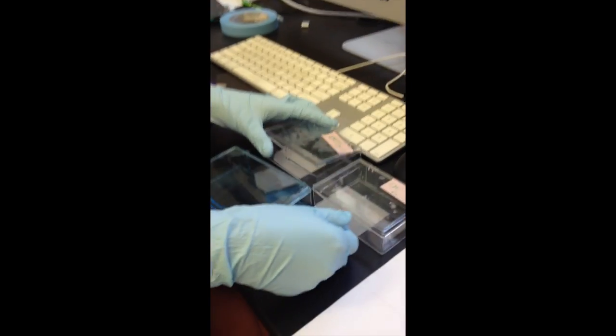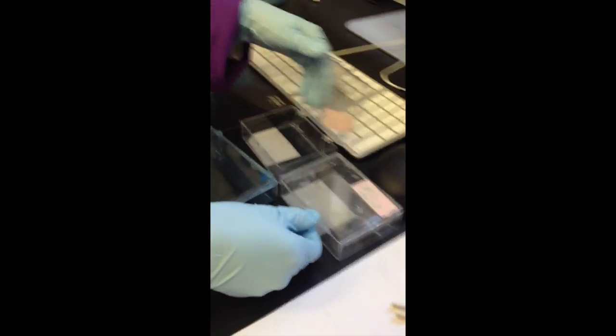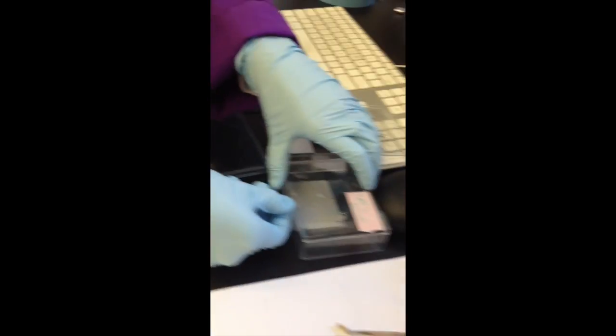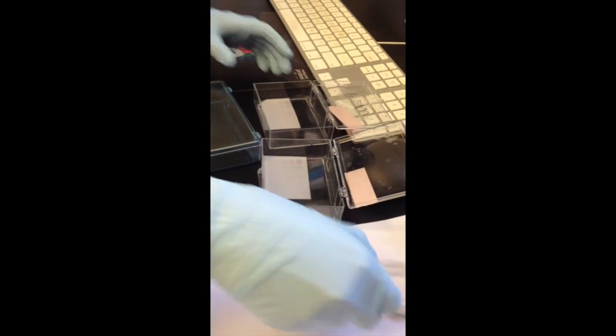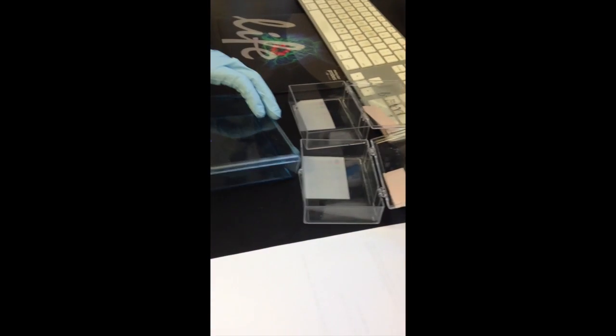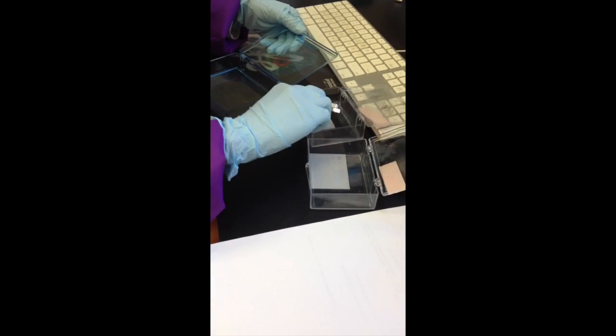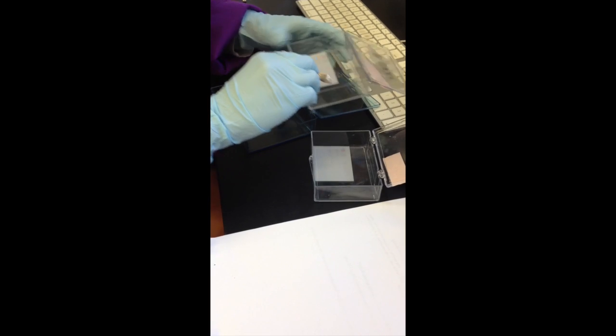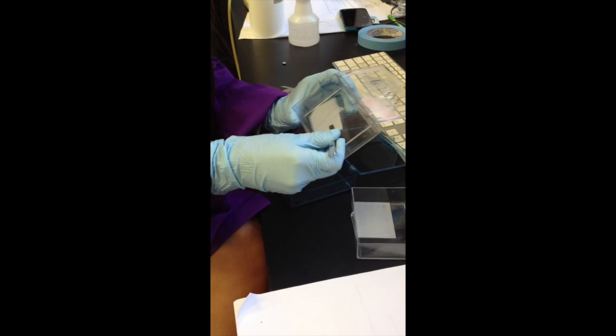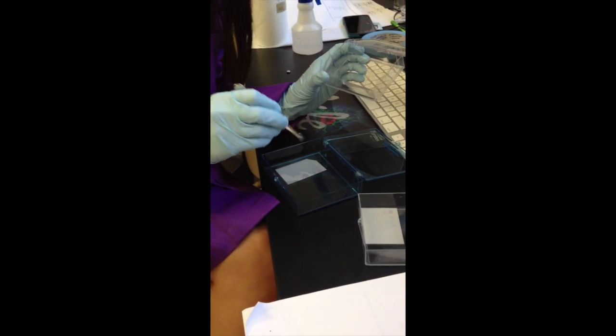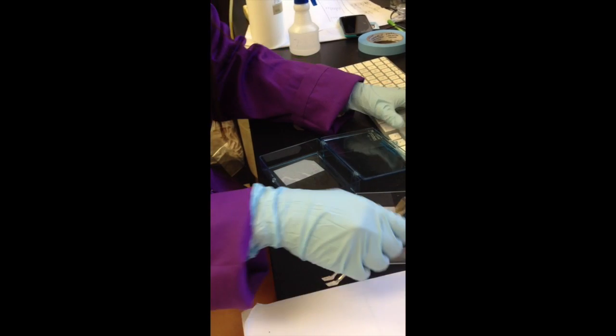So we have two blots here, chip 1 and chip 2, but it doesn't matter which blot you have. And we're going to transfer both of them. Make sure you know which side the protein is on. We will keep protein side up.